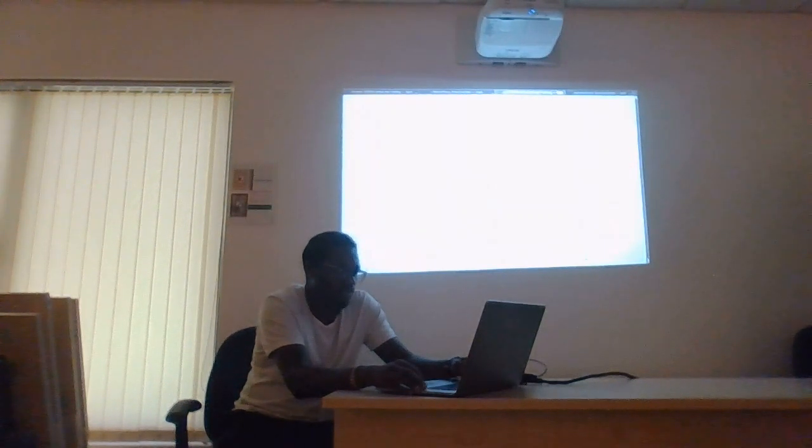So if you want to know the command that was running, or if you face any errors, the command is always beginning with command. Where's the execution? Looking for the log files? Yeah, the log and the command files. It didn't store it here. The command files are issued in the work directory? Yes.